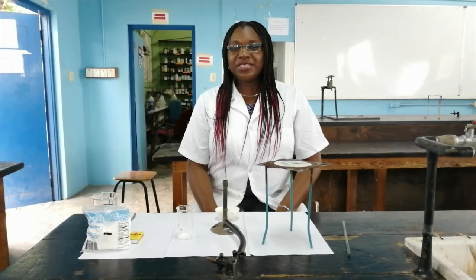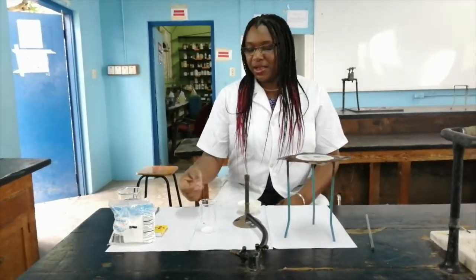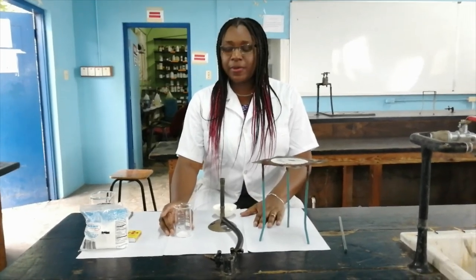Hello everyone, I'm your chemistry teacher Mrs. C. Williams-Massi and today we will be looking at the separation technique, evaporation.